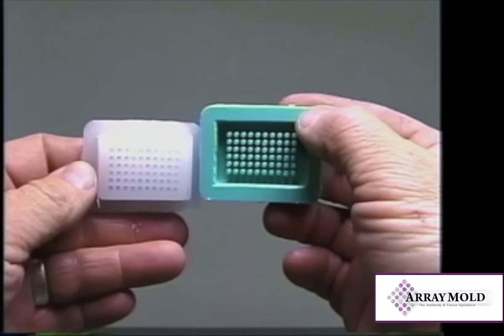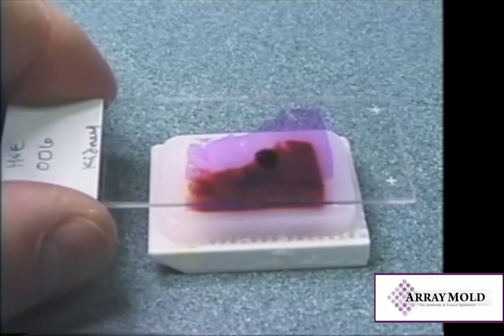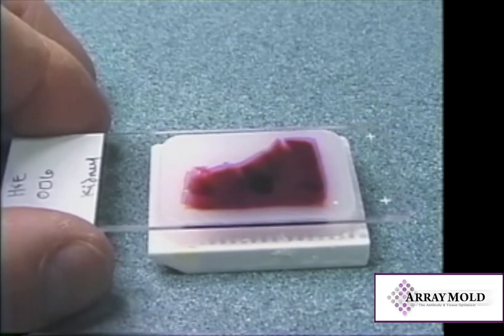The specimen layout is the same as any other array instrument on the market. An H&E slide is marked to show the proper punching site in the paraffin donor block.